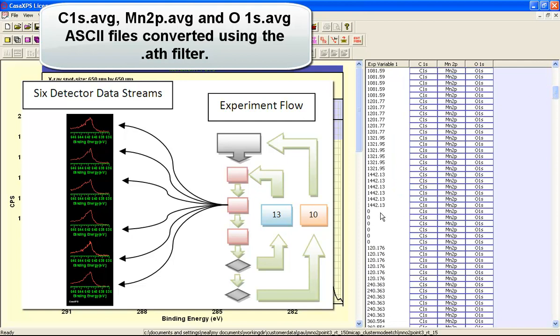And as we slide down this data file, you can see the repetition. So the iteration has started again. So we have six detector channels representing the Carbon 1S, Manganese 2P and the Oxygen 1S.